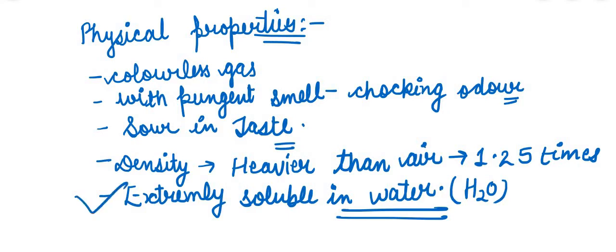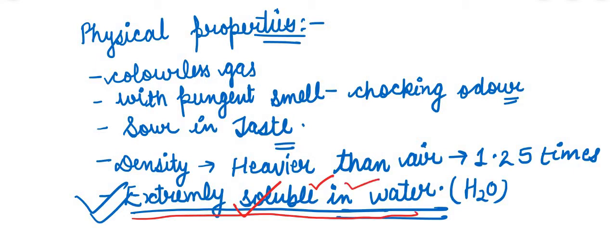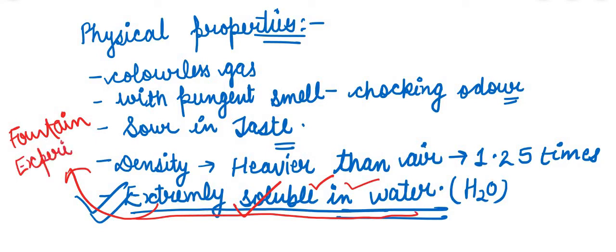So for this point, that HCl gas is highly soluble in water, we are going to take an experiment to show how this large amount of solubility in water is demonstrated, and that is known as the fountain experiment that we were discussing in the starting. That is known as the fountain experiment.